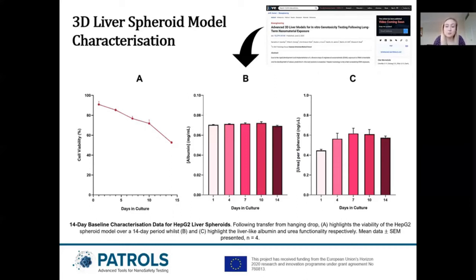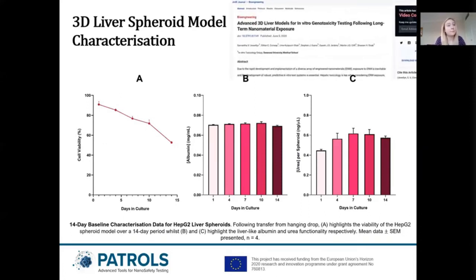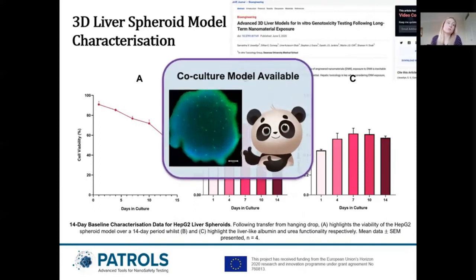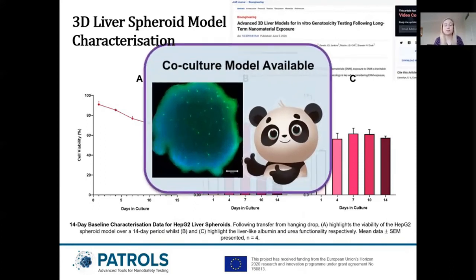However, I shall take this opportunity to take you through the development of the 3D liver model that we have developed and its particular applications. The methodology I'll be explaining or showing to you has also been published in JoVE, and there is a video coming soon to support that. In addition to this, we do have a co-culture model available, but this characterization data is yet to be published.